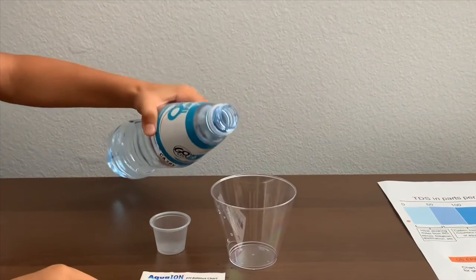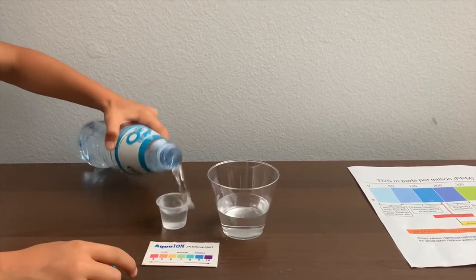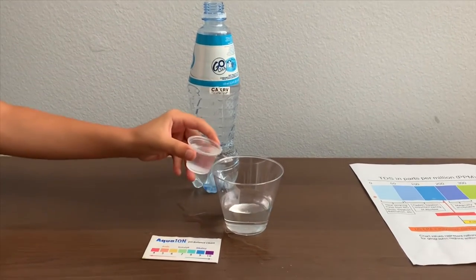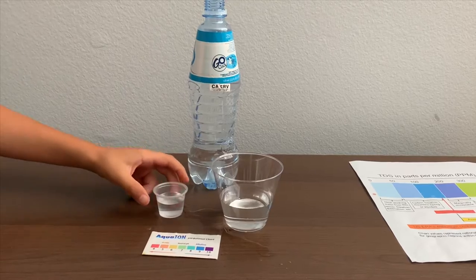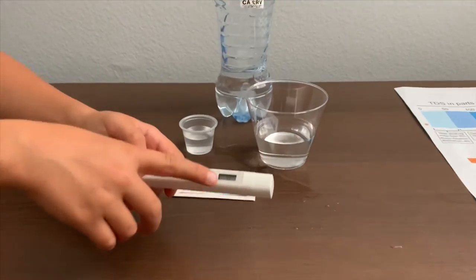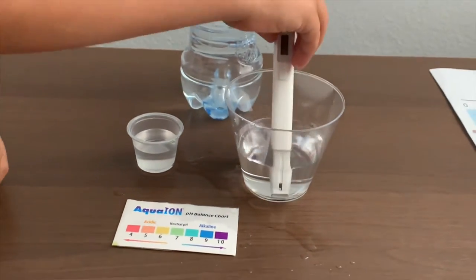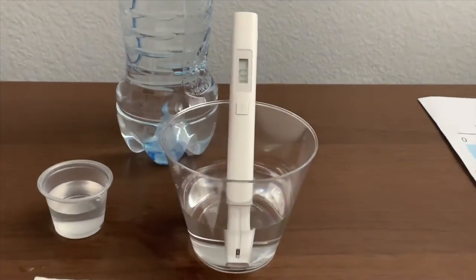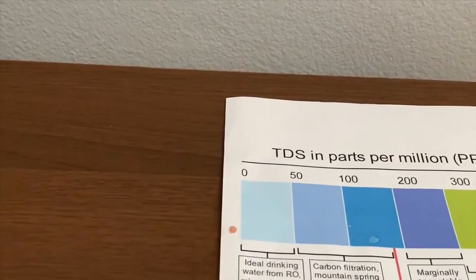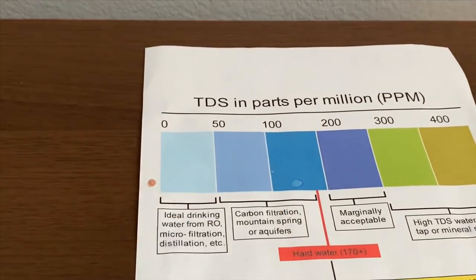Let's pour some water in. This is a little too much for the pH, so let's pour some back in for the TDS. Turn on the TDS tester, make sure it says zero, and put it in. A hundred and sixteen — that is marginally accepted. This is okay to drink.